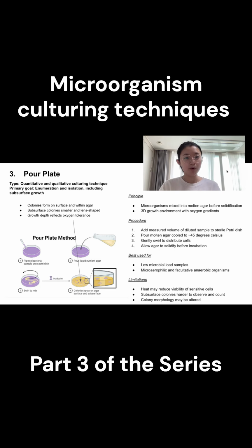Look at here is the pour plate technique, and this technique kind of sits in between the aforementioned two techniques of the streak plate and the spread plate technique. And this is used for both quantitative and qualitative purposes, for both enumeration and isolation, and this is because the colonies form both on the surface and within the agar.